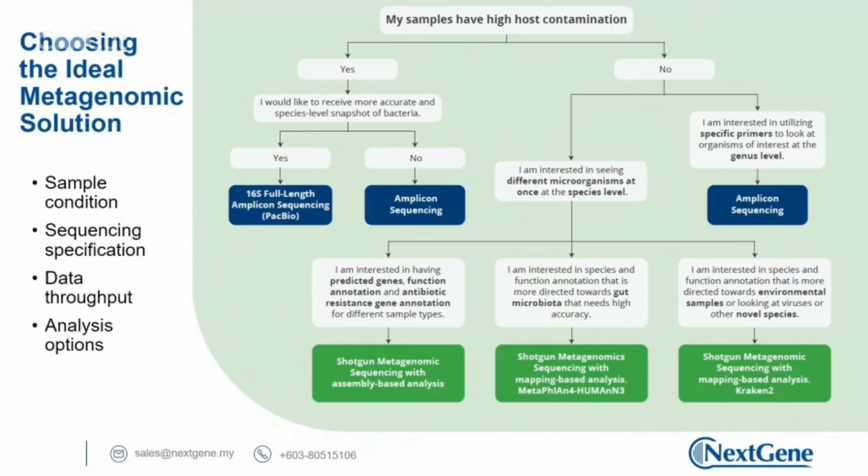because of the limitations of what we can cover on the amplicons, we are most likely not able to cover the whole 16S gene, because the 16S gene is roughly 1.5 kb in size, while the sequencing technology is only able to sequence, I think, 250 base pairs from one end and 250 base pairs from the other end. With some overlap in between, maybe we are looking at around 400 base pair target regions. So depending on whether you want to achieve high resolution or perhaps a more cost-effective approach, we can choose either full-length amplicon sequencing or short-read amplicon sequencing.